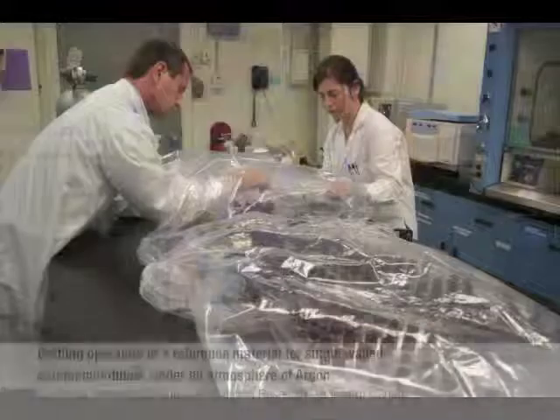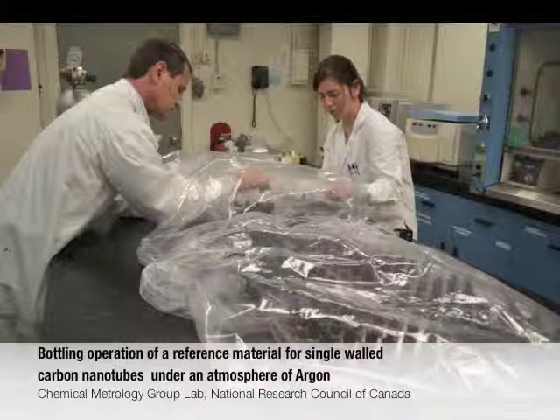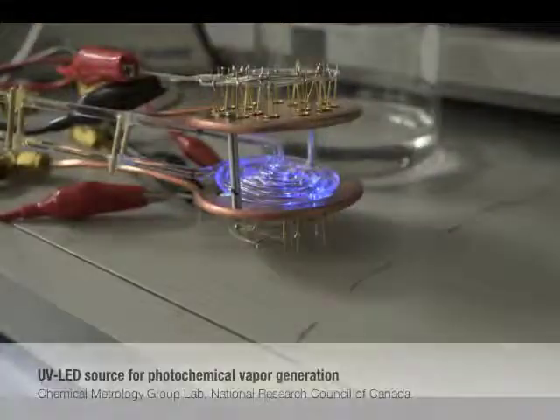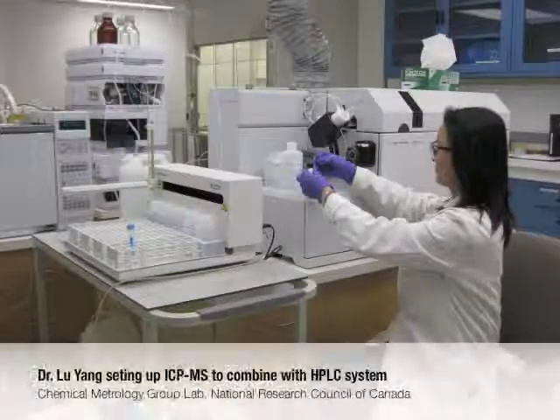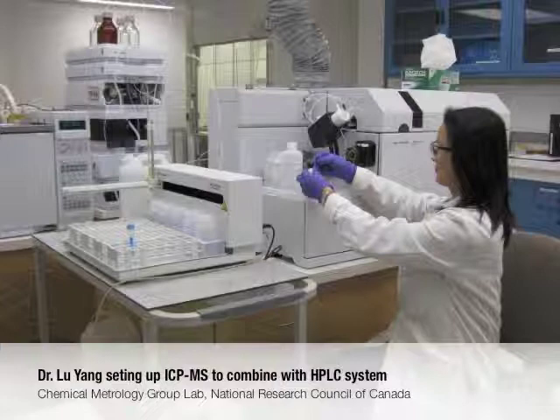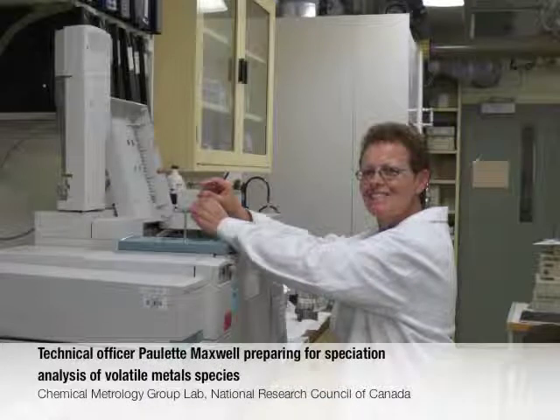That's a great question. I love it because that's what I'm currently working on. Most of my effort goes into that right now. Vapor generation of specific analytes does provide us with a means of circumventing a number of the problems that we spoke about earlier with regards to the first question relating to sample introduction. But unfortunately, vapor generation is just not something which can be applied to the majority of elements in the periodic table. When it can be applied, it's possible to do so with a 100% generation efficiency, which makes our sample introduction efficiency very high, and it can also be done with basically no adverse interference effects.